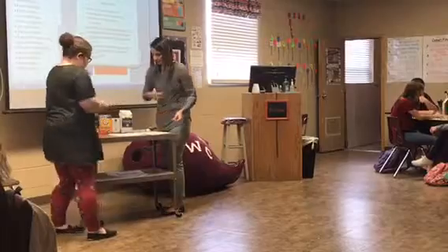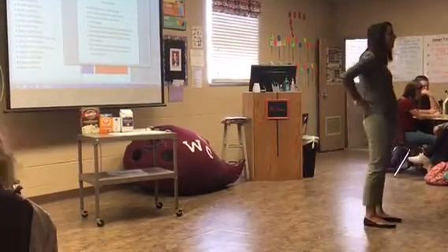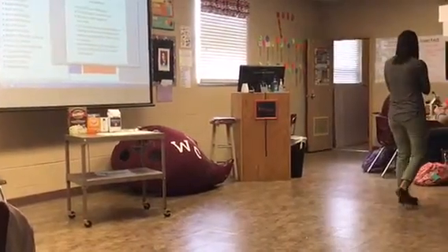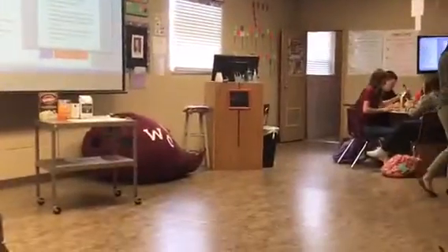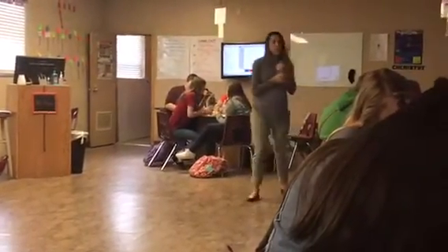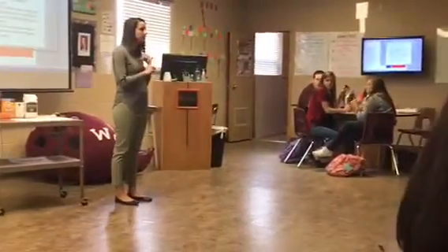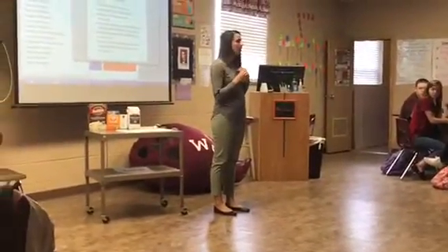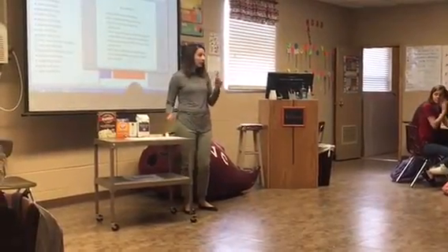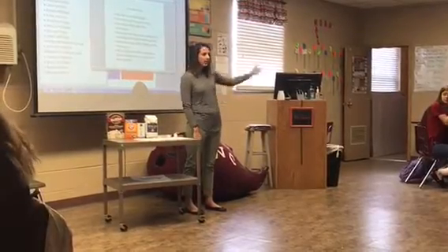Good? All right. Now that everybody has their slides, go ahead and look at the slide first. Write down any observations about the slide, and put it on the microscope to look at it. Once your table gets finished, pay attention, this is important. There's a couple things I need to mention. Once your table gets finished, there's slides up here and tape. You have to get the evidence from the mascot and take it back.